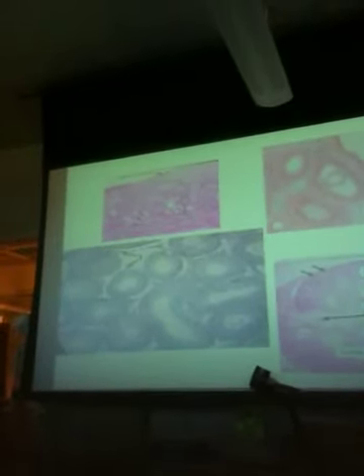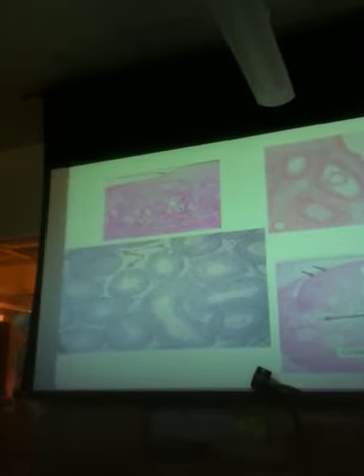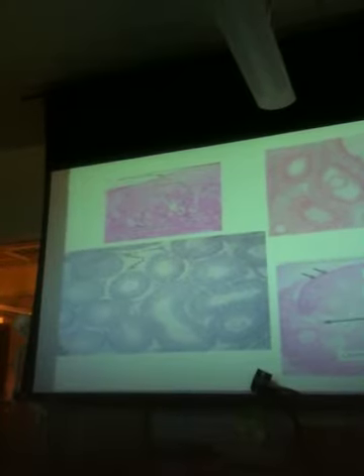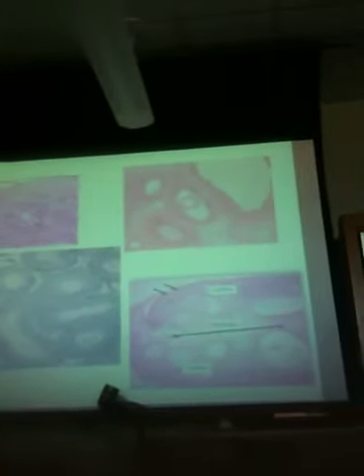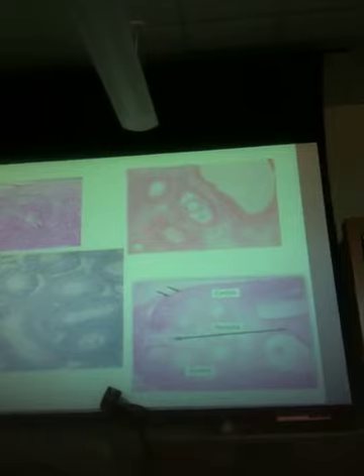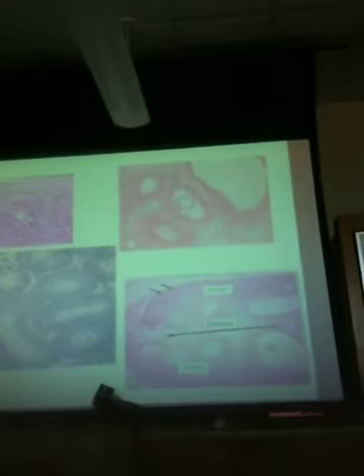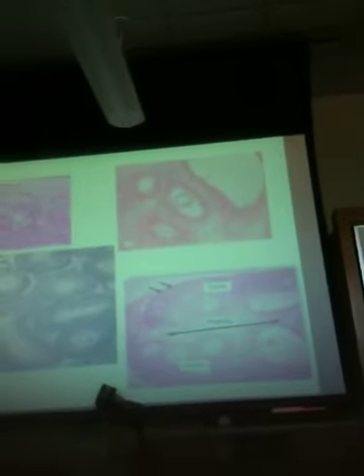Okay, so they're going to undergo meiosis 1 from puberty on, and the follicle is going to enlarge, and the oocytes are going to continue their meiotic division, and they get larger. So here is a follicle with an egg in it. This is a Graafian follicle right there. This is the stage that will rupture out of the ovary, releasing that guy.